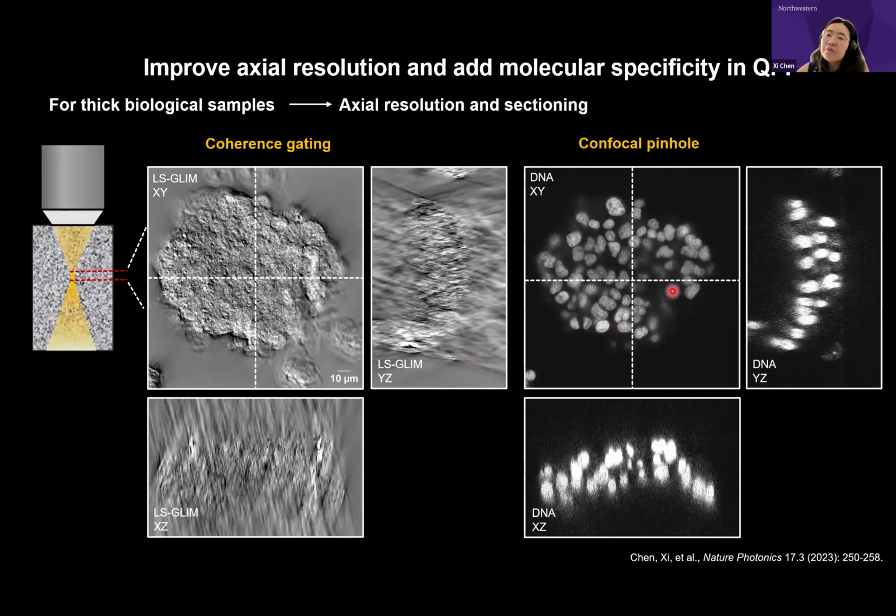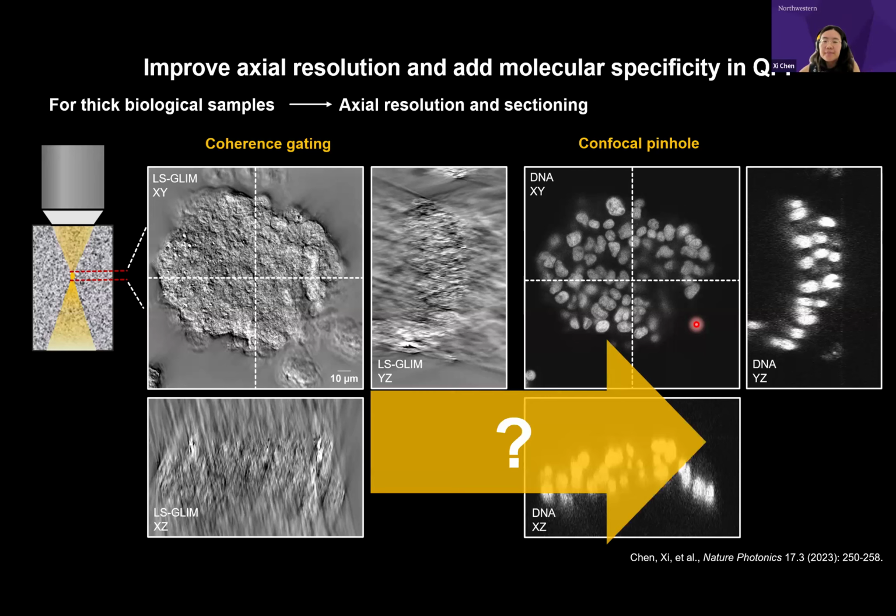However, with confocal, usually you need to fix and stain the samples, and the cells are not happy; they're dead. You can use live imaging dyes, however, you still have a limited ability to distinguish each spectrum. You have a limited emission bandwidth to look at the different cellular compartments of interest.